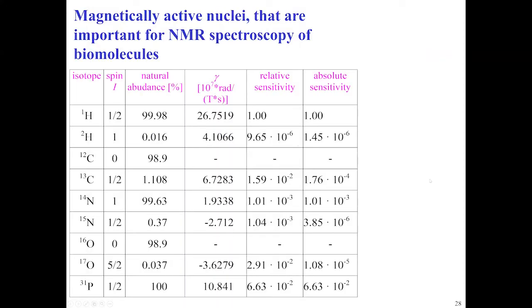Here is a little list of nuclei. I did mention already that you can pick any nucleus, any element in the periodic table gives signal. Typically, we consider proton NMR, 1H, very highly populated, big gamma, which has big sensitivity. What is interesting, it is spin 1/2, so it has 2 states in our little model of representation. So with the field, against the field.